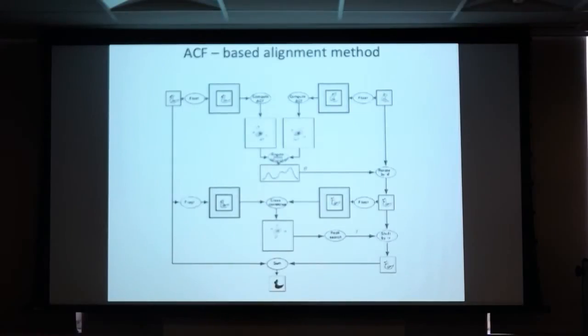We do have time for a couple of questions, sure. But I'll lead off. So, in the beginning, you used a foundational program known as SPIDER for a lot of these cross-correlation modalities. Simple commands. Now, what is your viewpoint now with the greater move to GPUs? How has that opened up more use of algorithms in this space?